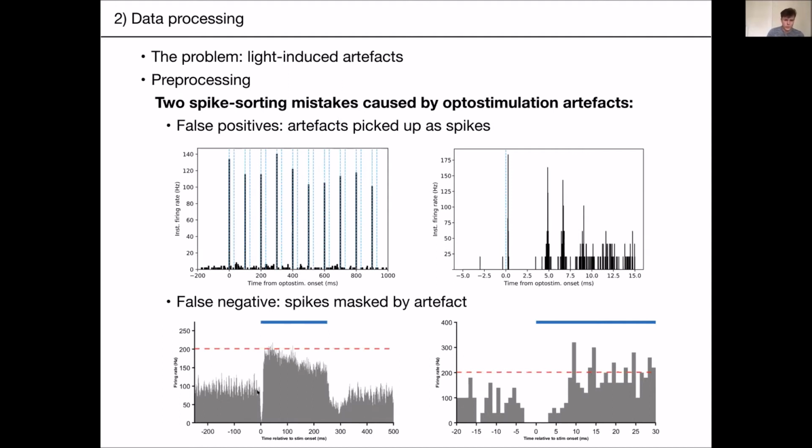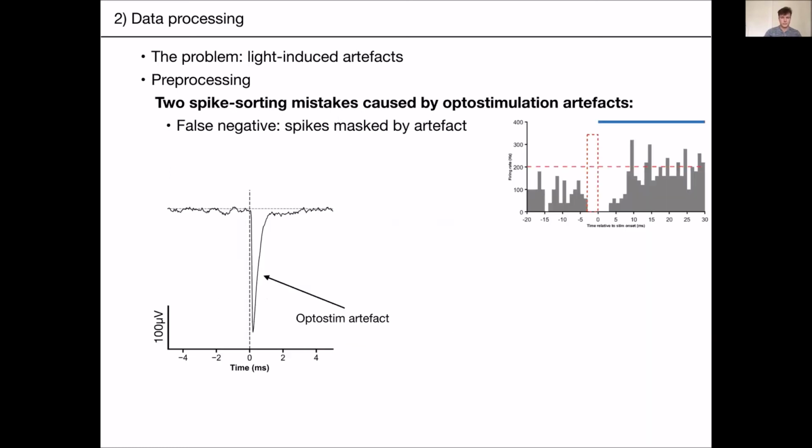And really, there is no reason why the neuron would stop firing suddenly when you start the light, and also why it would happen in the past. This really doesn't make sense, because as you see there, the neuron stopped firing from -4 milliseconds or something. And we're going to focus on this phenomenon now and explain why this happens, and teach you how to notice these things and trash them away, essentially.